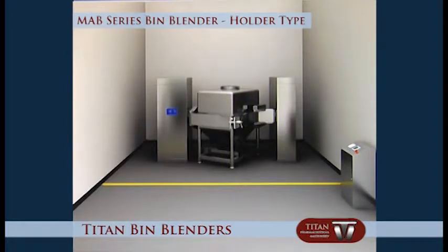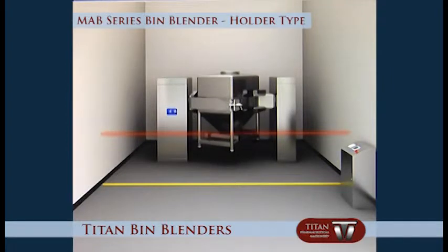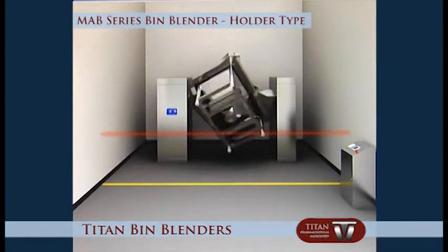Infrared safety sensors are activated and the bin is automatically raised to the set height. The bin blender then functions accordingly to the preset mixing time and speed.